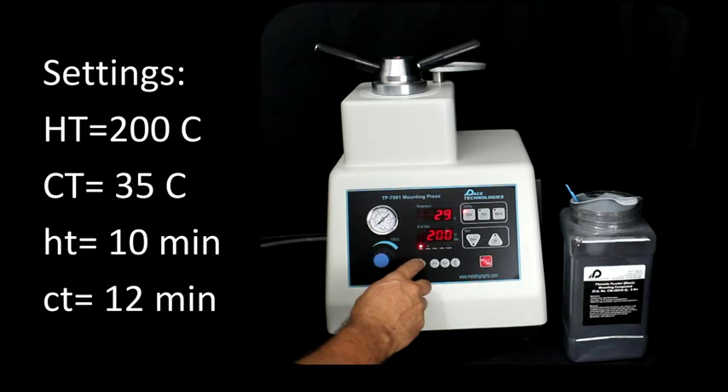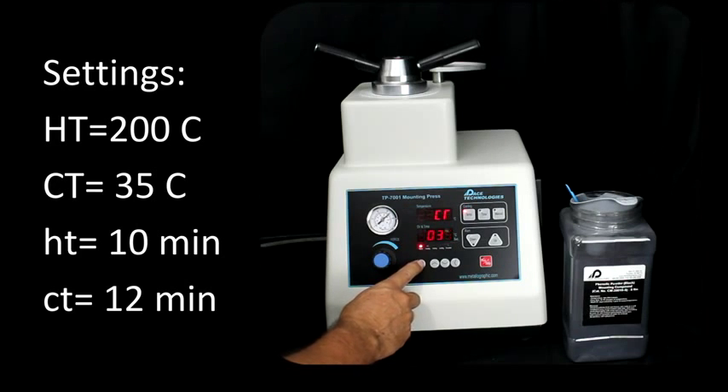Now let's go ahead and check our settings. Our heating temperature will be 200 degrees Celsius. The cooling temperature, if we select temperature for cooling, will be 35 degrees Celsius. The heating time, once we reach temperature, will be 10 minutes.